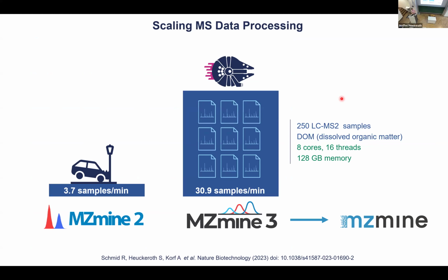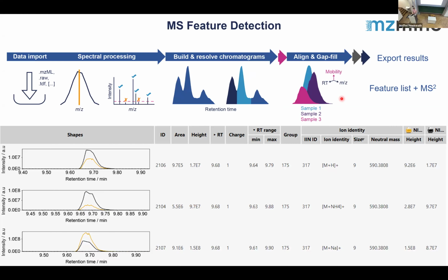And another great thing is that compared to MZmine 2, we are a lot faster. You can process a lot more data sets on a lot less system memory. And I hope everybody has at least 8 or 16 gigabytes of RAM. If you don't, then we just take a small subset of the data because we also have all the results uploaded. So you don't have to do the full data set. Maybe if your laptop crashes or MZmine crashes, which might very well be, then we can just download the results in the end for the next sessions. So that shouldn't be a problem.